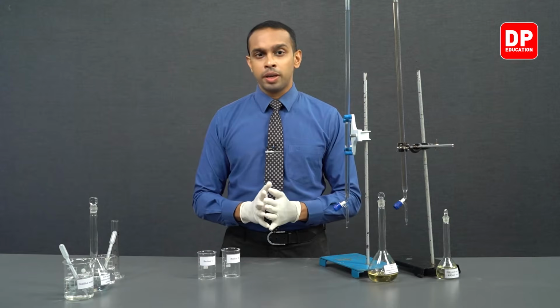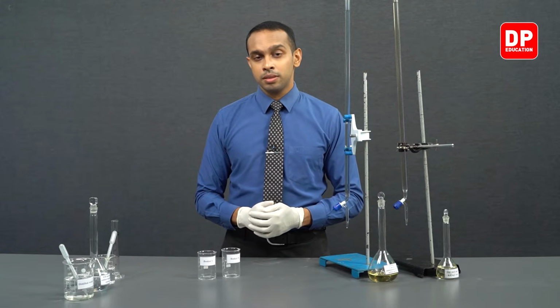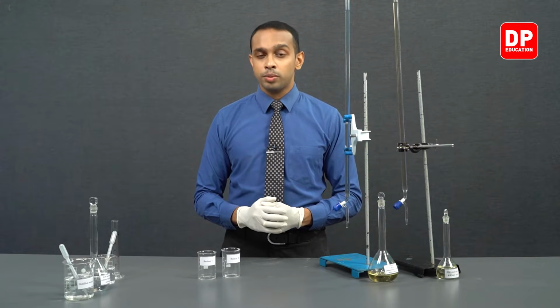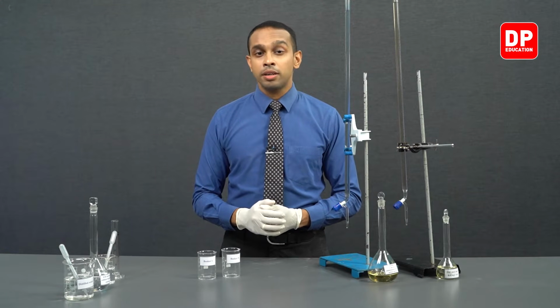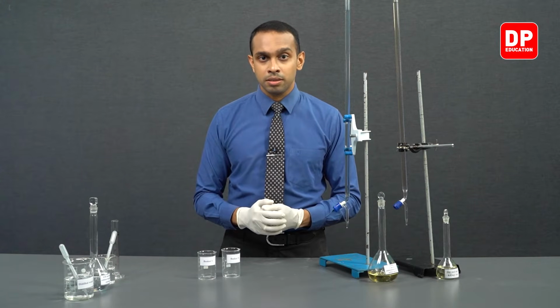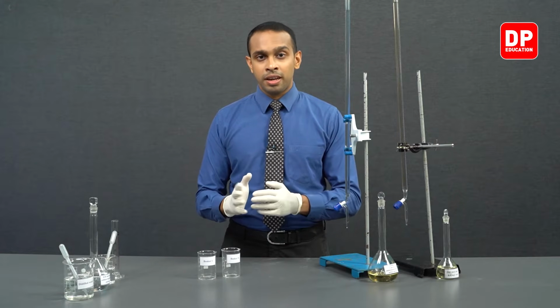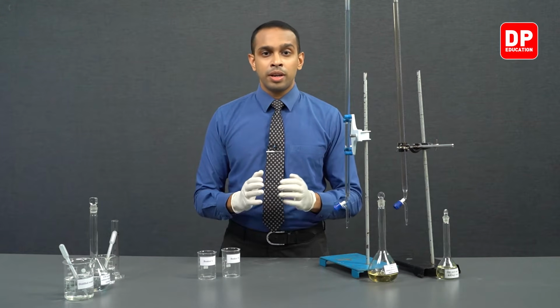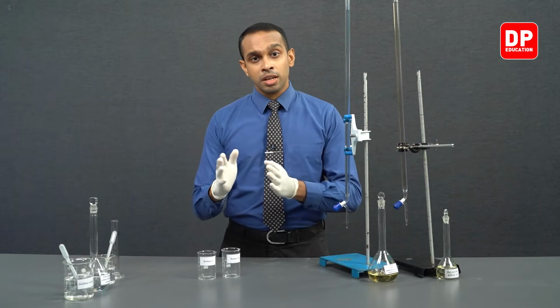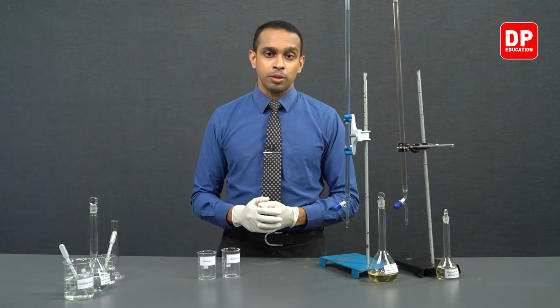Before we proceed to that, let's understand what is taking place in this experiment. In this experiment, we are trying to observe the order of the reaction in a reaction between I- ions and Fe3+ ions, or in other words, iodide ions and ferric ions. The reaction between iodide and ferric ions results in forming I2 and Fe2+ ion solutions.